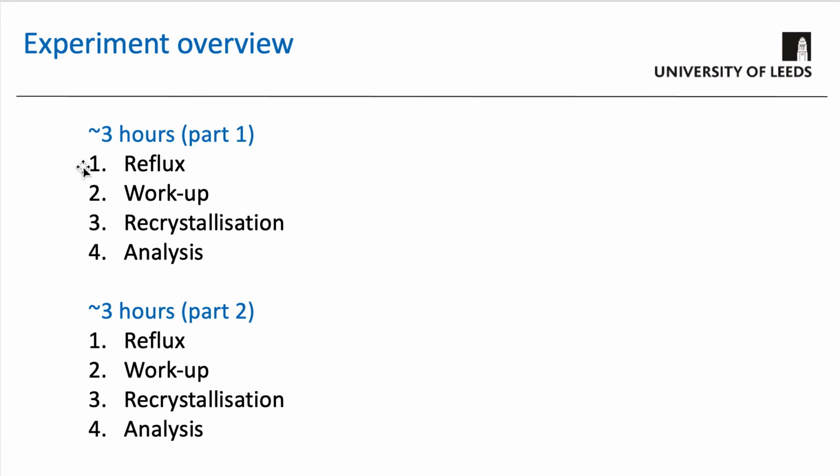In the first session, it's usually about half a day to do each step. You've got a reflux in the first step, then a workup with liquid-liquid extraction, then a recrystallization, and then your analysis. The second step is very similar: a reflux, workup, recrystallization, and then your analysis. The analysis of your final product will be the one that involves the NMR as well.